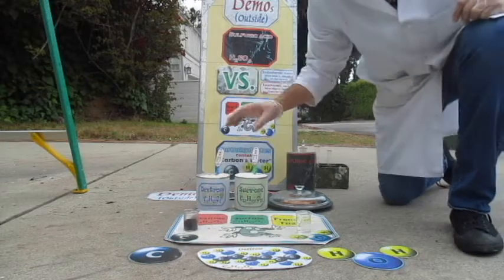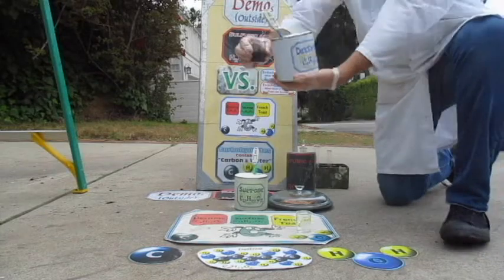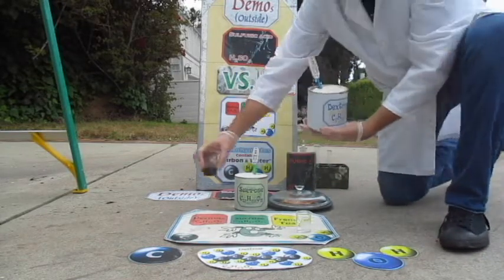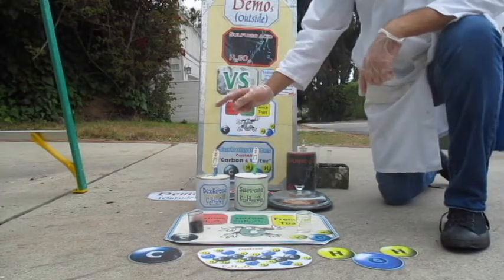So what we're gonna do is, well, look at this, by the way. Notice, this doesn't look much like carbon. Almost completely opposite of what carbon looks like. So it's funny, does this really contain carbon? We're saying it does. Well, why don't we see that carbon? Why don't we get that carbon out?